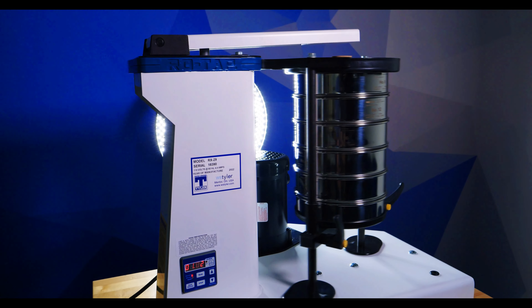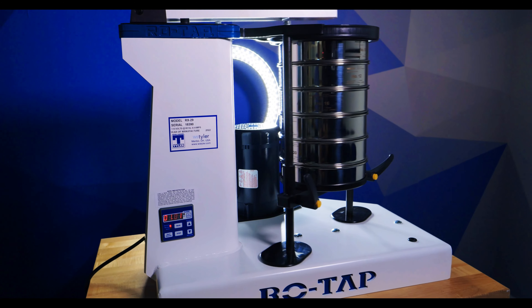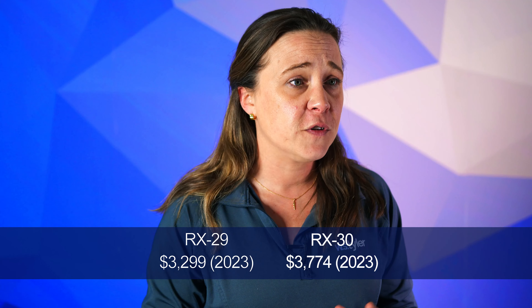Currently, there are two mechanical sieve shakers offered by W.S. Tyler: the Rotap RX-29 and the Rotap RX-30. The RX-29 is designed to work with 8-inch test sieves, whereas the RX-30 works with 12-inch test sieves, and they're two of the most widely used mechanical sieve shakers. The RX-29 costs $3,300 and the RX-30 costs around $3,800. For sonic sifters, there's a handful of models on the market. Much like the Rotap product line, the biggest difference between these models is the type and size of test sieves you use. You can expect to pay anywhere from $8,130 to $9,000 to implement a sonic sifter into your operation.